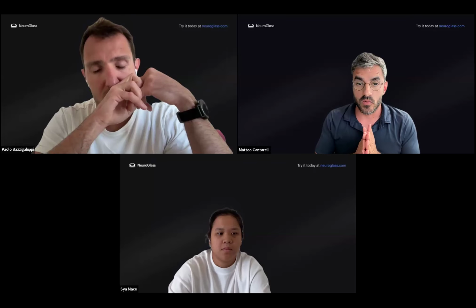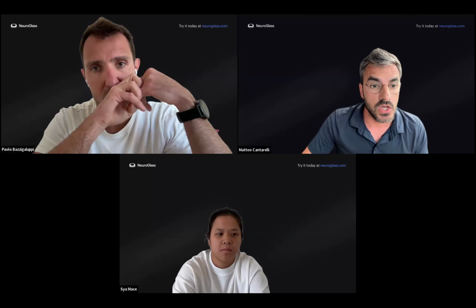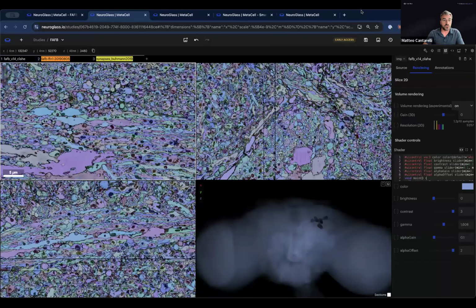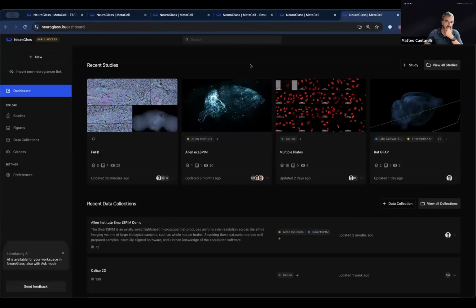Okay. So I want to give you a very brief demo of the kind of things that you can do today with NeuroGlass. So let me share my screen. Okay, great. So first of all, how do you use it? You go to neuroglass.io, and in order to log in, you can just use your Google account or GitHub, or you can register and just have a traditional user email and password.